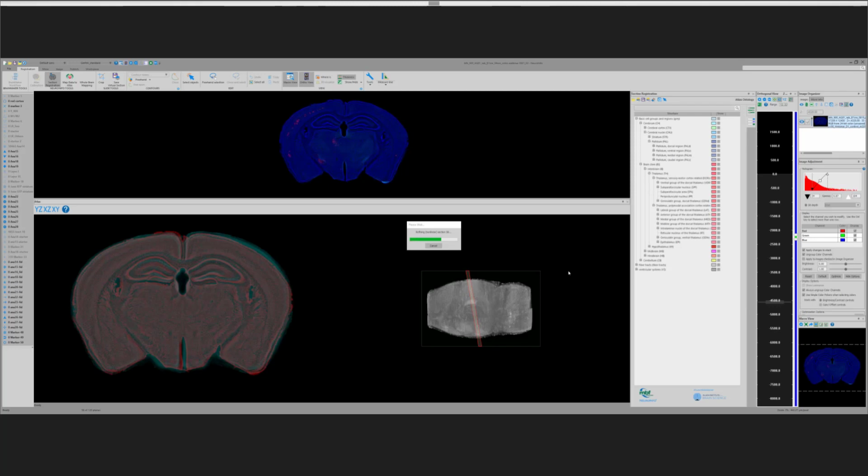Right, and so what we can do is click visualize these, and we'll provide an overlay into the atlas itself. I mean, into the registration itself. Yeah, and as you're moving your mouse, you can see in yellow below the overlay image the name of the anatomic region that your mouse is hovering over.